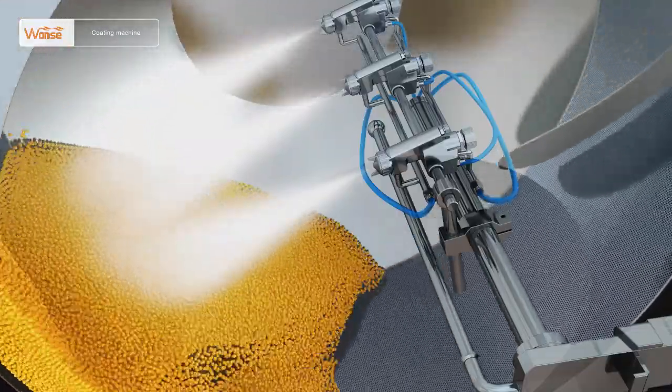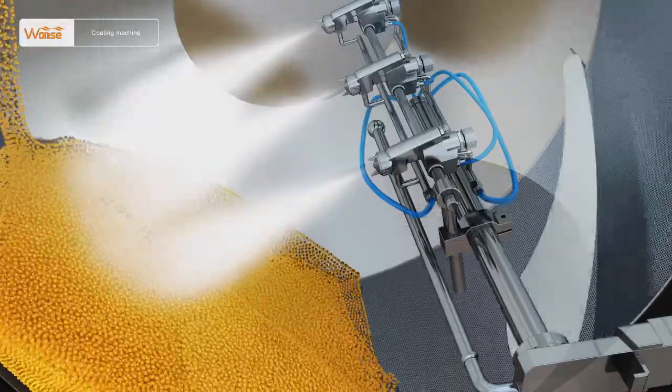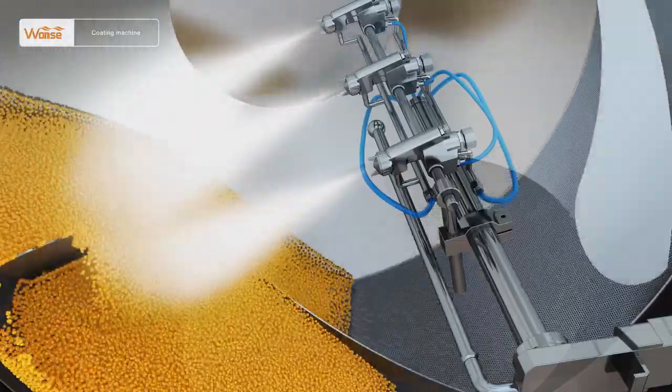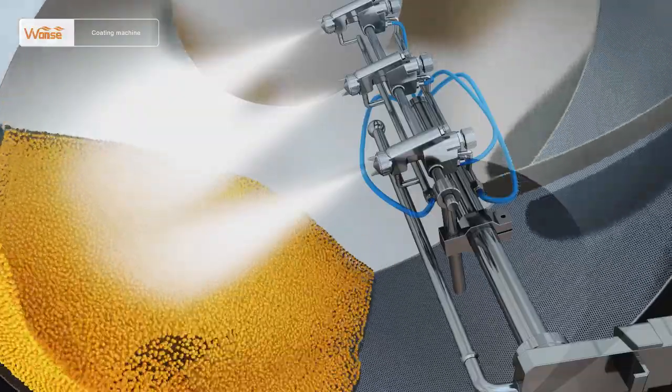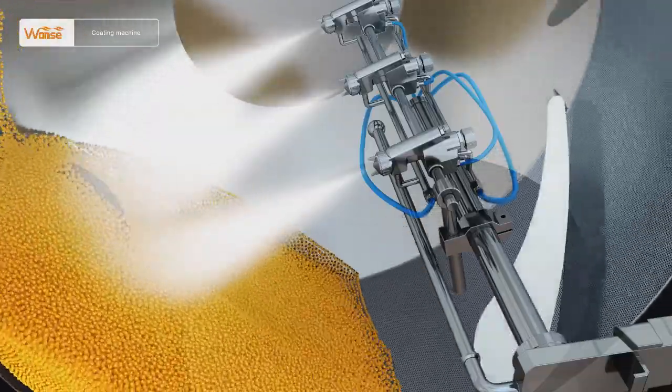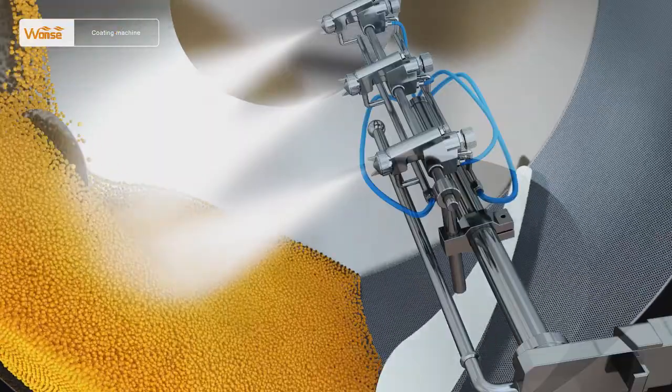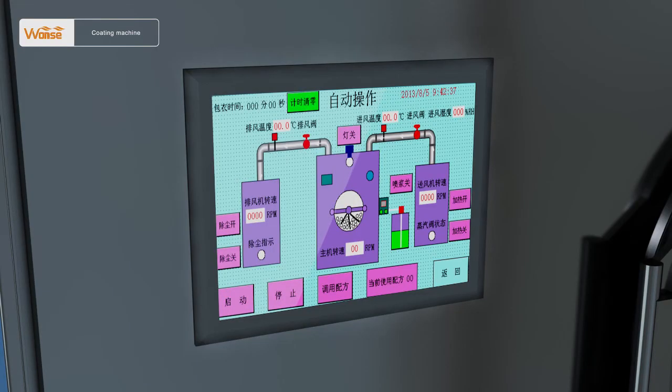Observe if there is any occurrence such as adhesion, temperature rise, decrease in spraying amount, fragment, reduced rotation speed, or lowered emission. Adjust the rotation speed of the hot air cabinet and air exhaust cabinet to make the hot air and air exhaust basically balanced, and set the gun cleaning intervals.